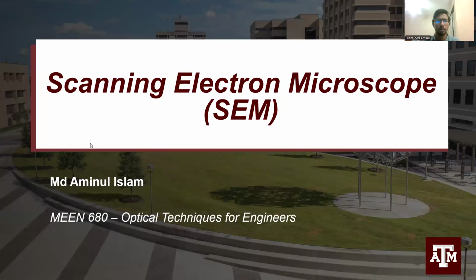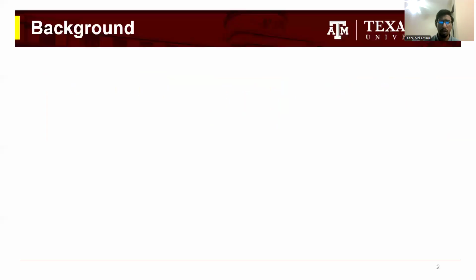Today I'm going to talk about the scanning electron microscope as part of the final project for MEEN 680 Optical Techniques for Engineers. Let's first start with the background of the electron microscope and why we need it.